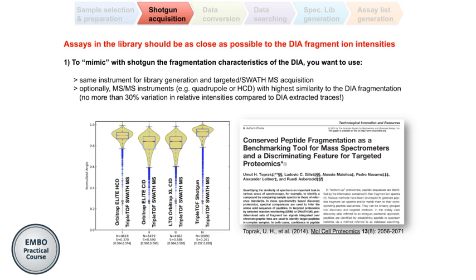When I tried to describe this in the paper, it's very technical and complicated to describe, but actually the Thermo machines are the most reproducible in shotgun, but they are a little bit further away from SWATH than the TripleTOF itself.